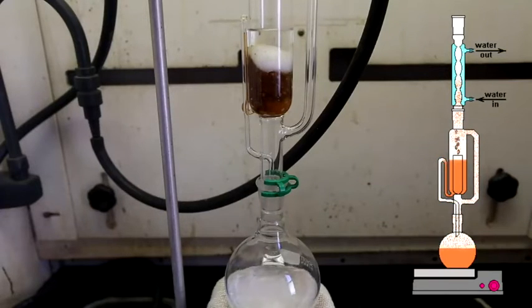This process should run for a total of around 14 to 16 hours. Once the process has finished, the ethanol should be evaporated using a rotary evaporator, leaving a small yield of extracted sample material, about 2 to 3 milliliters, in the round bottom flask.